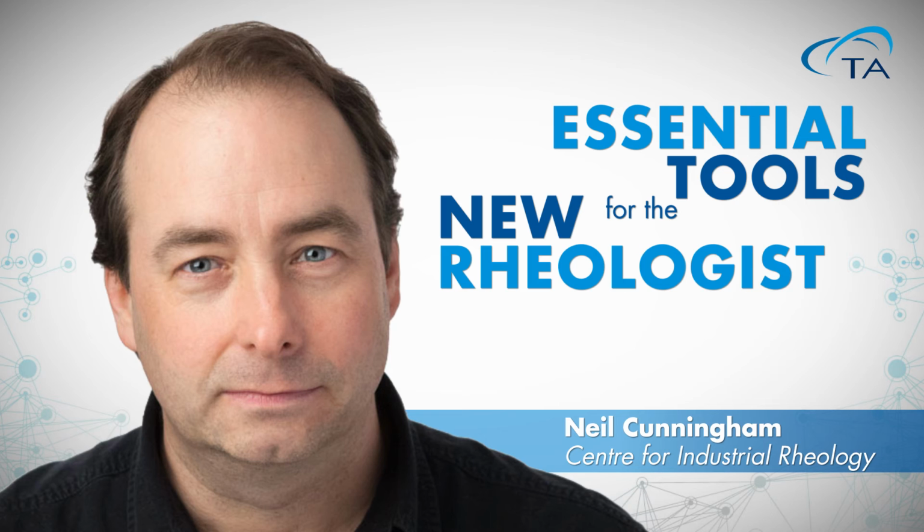Okay, thank you, Dave. So I think from a practical point of view, it's worth thinking about the main differences between controlled stress and controlled rate or controlled strain testing. First of all, it's useful to bear in mind that controlled stress testing is a very gentle approach, and it tends to be a lot more gentle than controlled strain and controlled shear rate or strain rate testing. So with controlled stress testing, you're just gently pushing the sample and looking at how it responds in various ways to that applied stress.